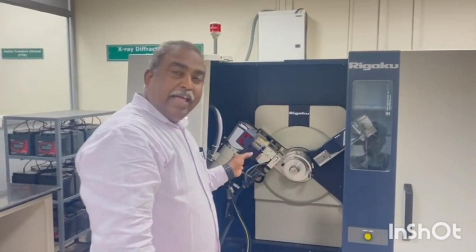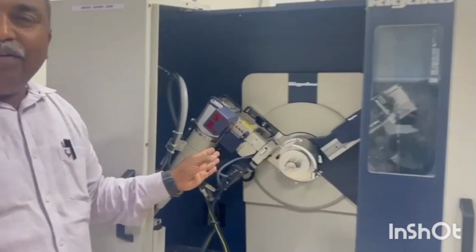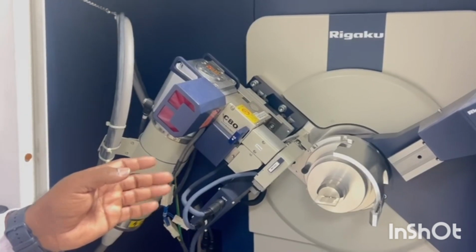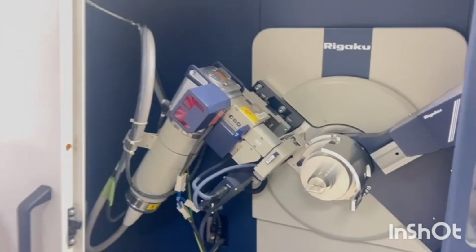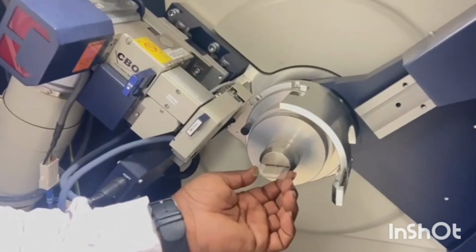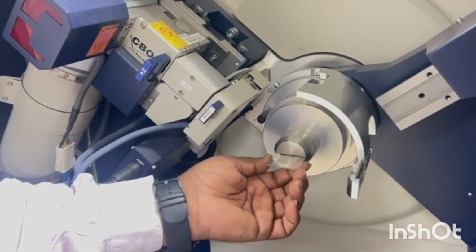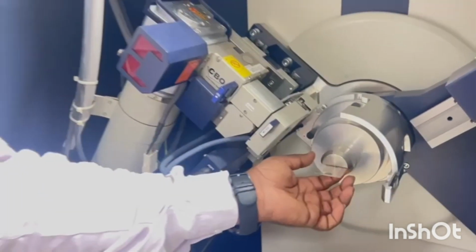So we have an X-ray tube which produces X-rays. Then I have an anode which produces monochromatic X-rays. Here the anode is copper, so it produces monochromatic X-ray. Then we collimate through a slit and make them hit the sample holder here. Generally we use crystalline materials of grain size less than 2 micron. Then we pack it tightly, then we keep it over the holder.